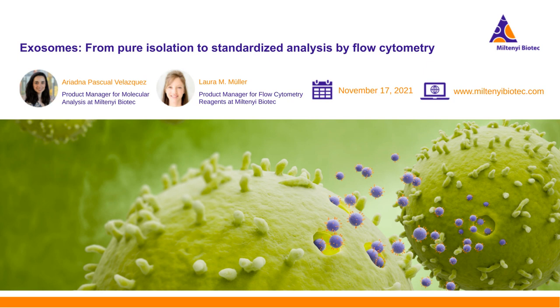So unfortunately, we don't have these. When we talk about the Multiplex beads, the staining antibodies are human specific. Therefore, we have an additional assay for mouse. The antibodies are really species specific, so you would not detect any other vesicles from, like, the microbiome.